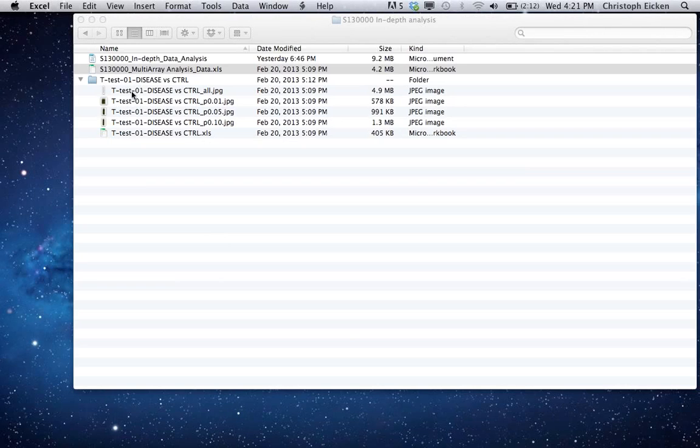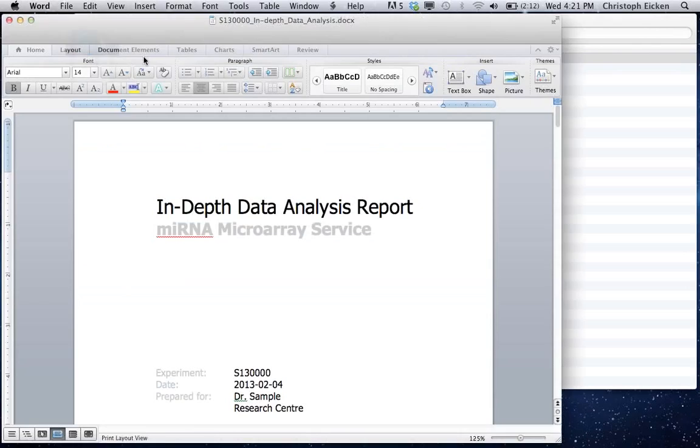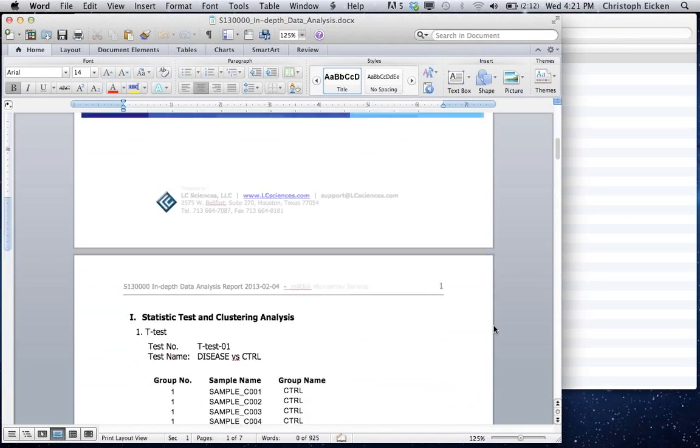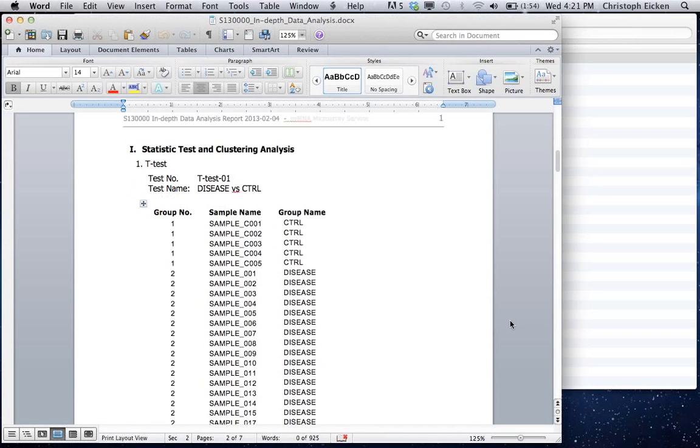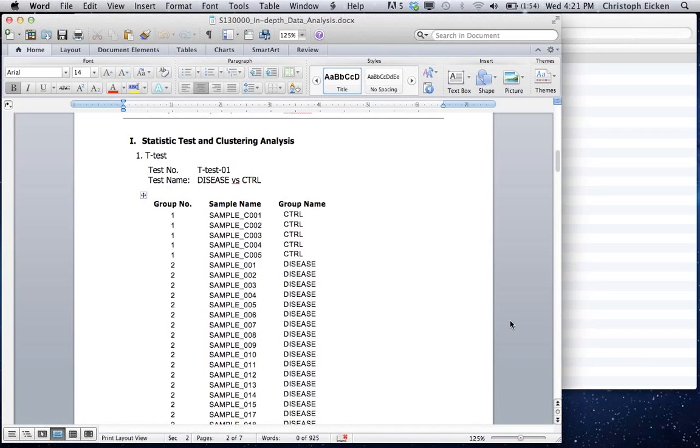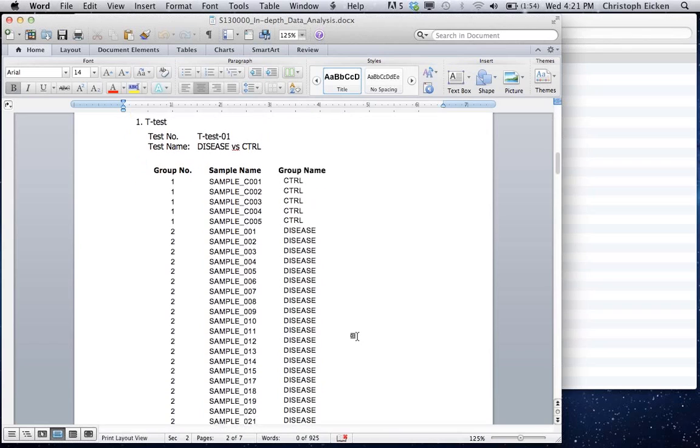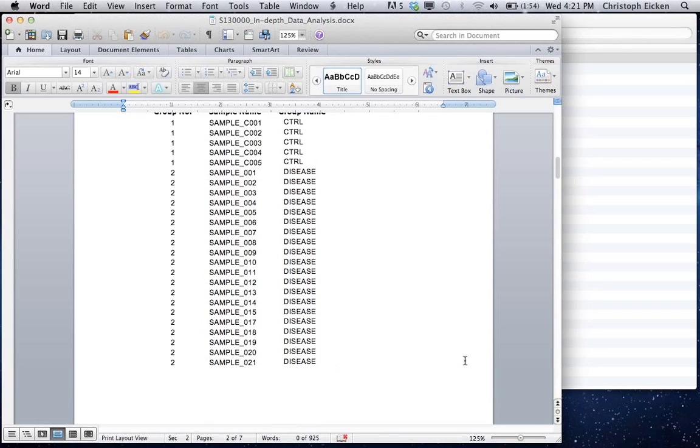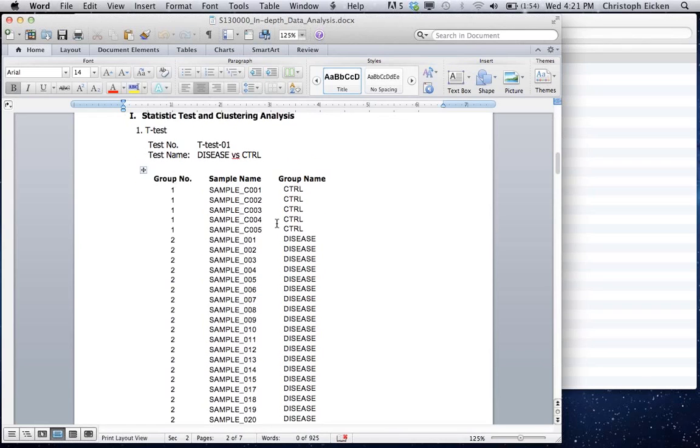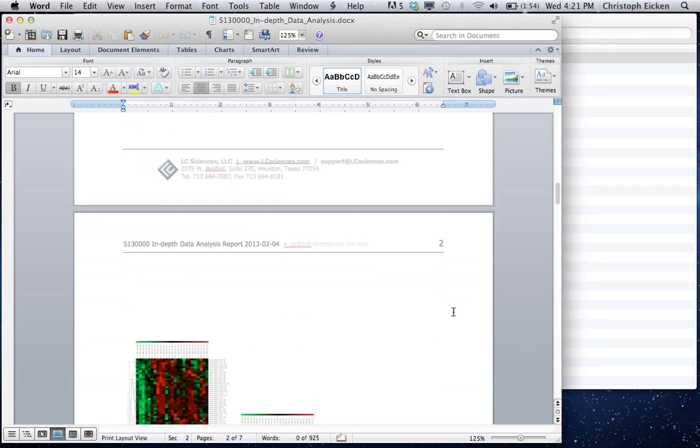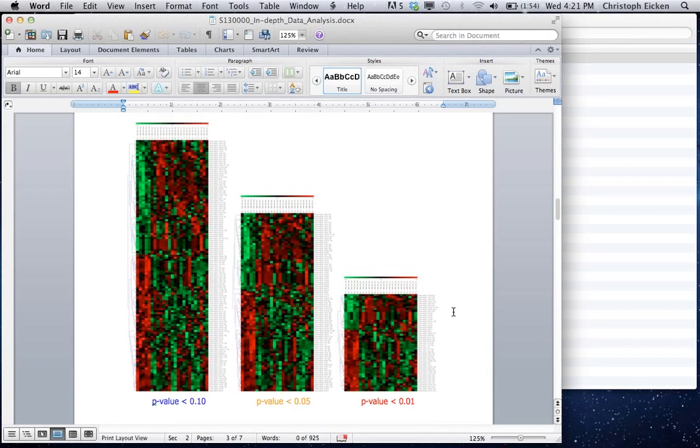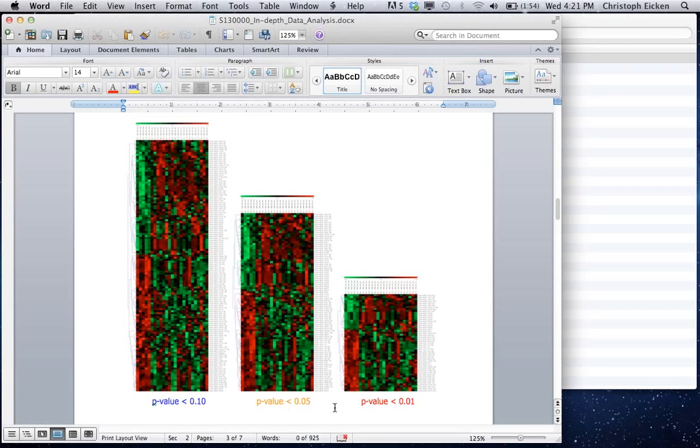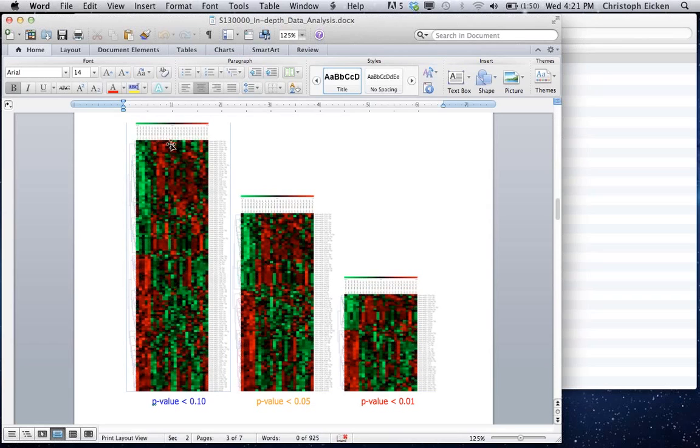If you're looking at the individual statistical test results, we sent you already via email the so-called data analysis report. So what is listed here are the individual t-tests, one-way ANOVA, two-way ANOVA, paired t-tests, whatever is applicable in your case or what you requested from us. Here I'm just showing you a simple example of a regular t-test. So in this case we had a couple of control samples and then a larger group of disease samples. So typically here you see the summary of what was done, how the samples were grouped. Then on the next page you see different heat maps with different p-value cutoffs. And you see here it clusters nicely together.